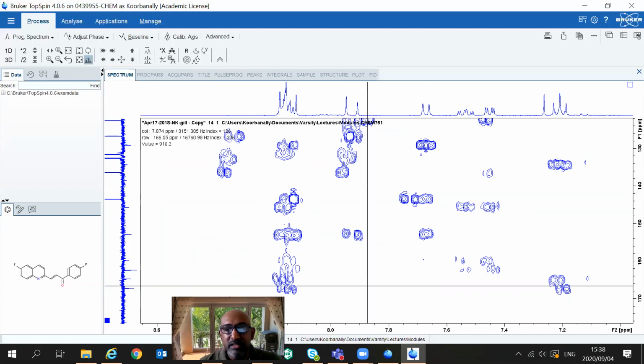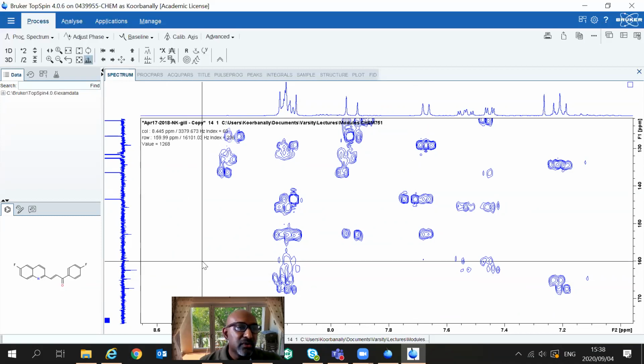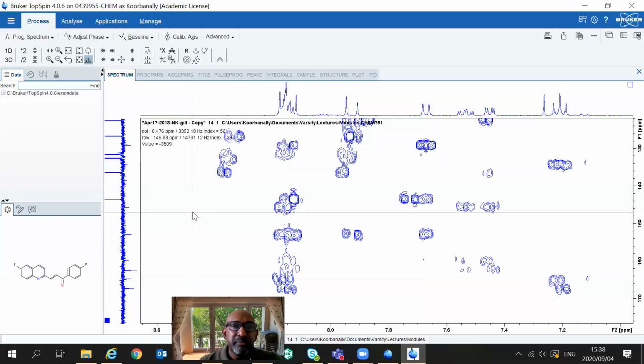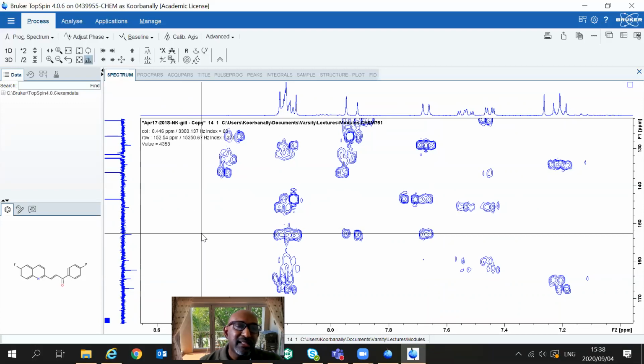Your carbonyl peak you can actually pick out, because that was very easy to pick out. And these peaks you picked out are the doublets for these carbons, right? So the other peak in that spectrum, we actually don't know, but we're going to look at the carbon spectrum again and see if we can get any ideas now that we know what we've assigned. This other peak around 154, we didn't assign that yet, right? So this peak around 154 wasn't assigned to anything. And let's see if I can get some information around this peak around 154.